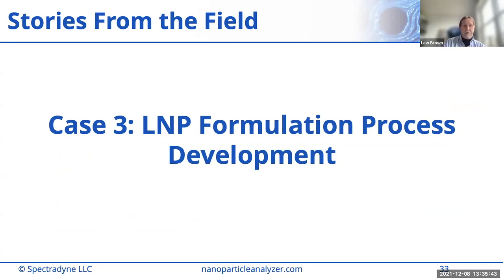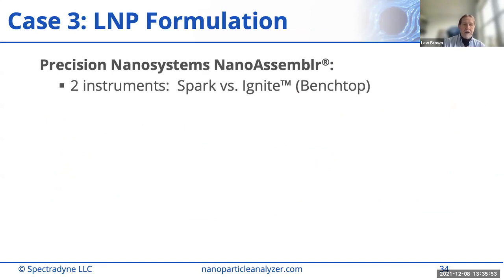Moving on to the last example, this is again LNPs, and this is in formulation process development, kind of an interesting study. Probably a lot of you out there may have familiarity with the Precision Nanosystems NanoAssembler product. Basically, it's a product that uses microfluidics to do a highly controlled mixture to generate particles such as LNPs, liposomes, or polymeric nanoparticles. Okay.